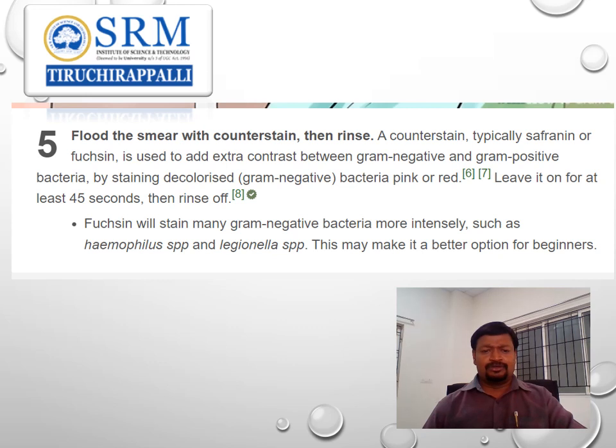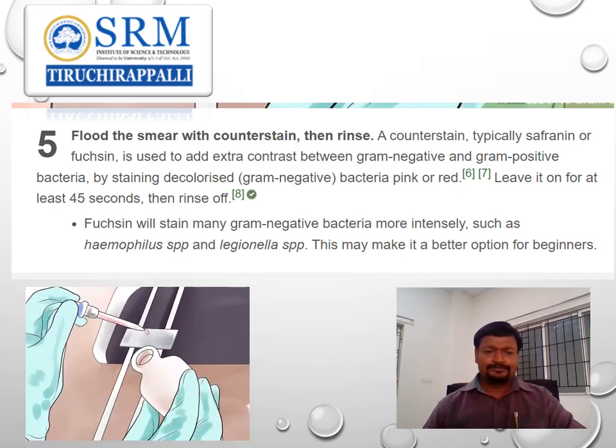Fuchsin will stain gram negative bacteria more intensely, such as Haemophilus species or Legionella species, and may be the better option for beginners.